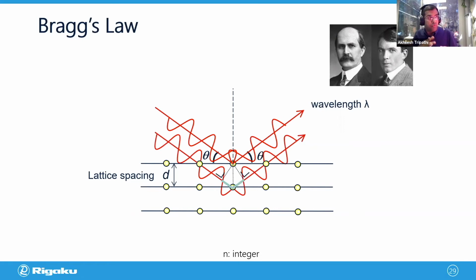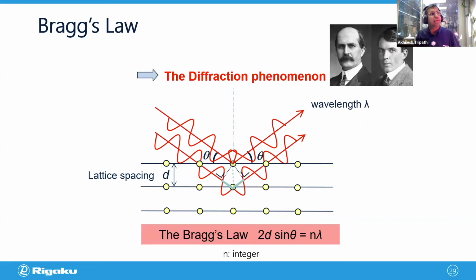And so this is diffracted. But if you can imagine this, several layers can either enhance or cancel, because this X-ray has wave-like character. So you can have constructive or destructive interference. That's the word. Depending on how far these layers are and which atoms compose these layers, as this X-ray, in terms of several wavelengths, hits the material, we are having constantly constructive and destructive interference. So imagine your instrument is providing the X-ray, hitting the material, and based on your material, which is unique in the sense that they have different d spacings and the atoms, you are getting peaks at different positions. So everybody understand this is how the peaks are coming.